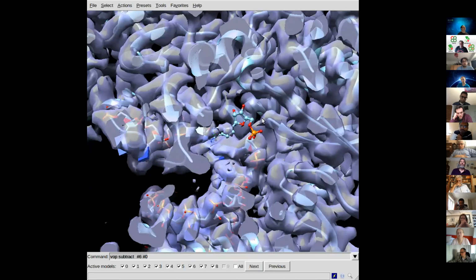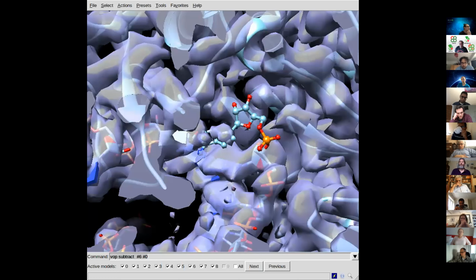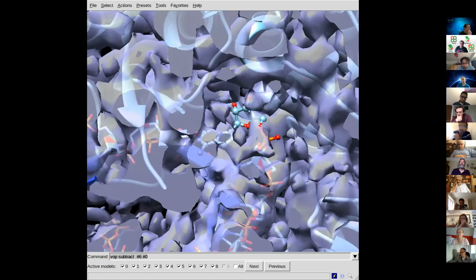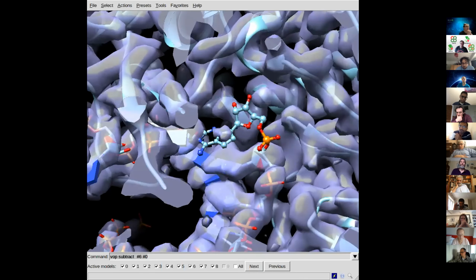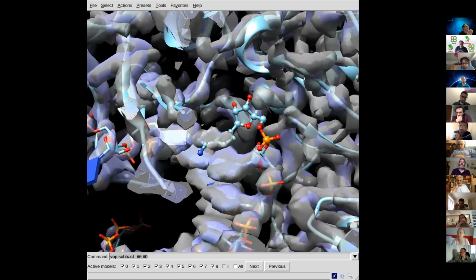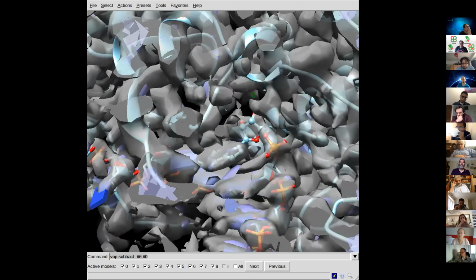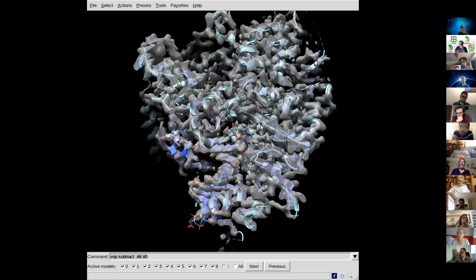But anyway, what is good is that in this map where there isn't supposed to be a drug, there isn't any density for the drug, except if you go to really low thresholds. But something pops up with the nucleotide which maybe should be investigated. But if we look at the map which has a drug in it, that clearly gets something at the nucleotide quite strongly, but it is weaker, as people pointed out. I didn't do any sharpening or blurring.